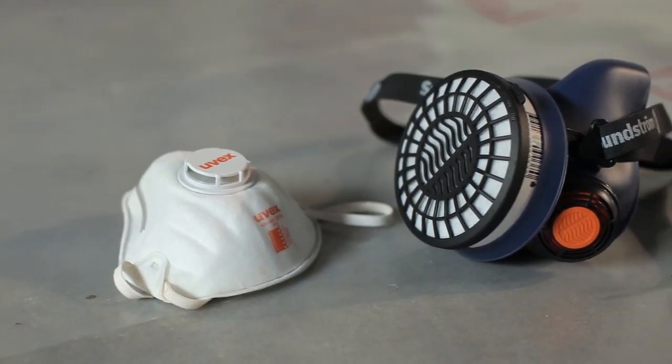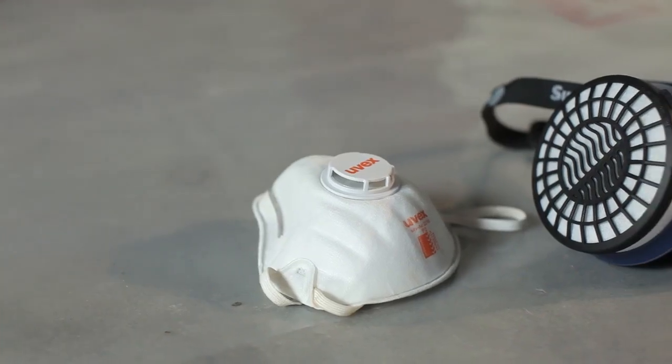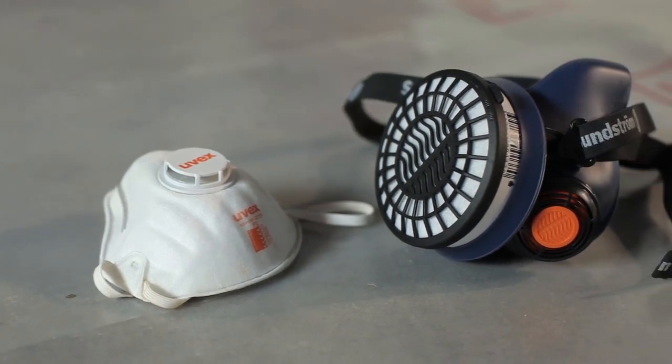Disposable and reusable respirators are fitted with filters to protect you from inhaling dust, vapors and fibers. The respirator and filters that you use should be rated and suitable for the kinds of hazards present. You can use a disposable or reusable respirator.